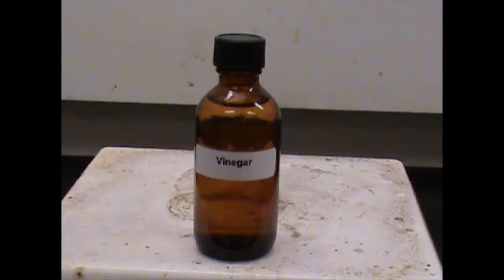For part A, the base we'll be using is 0.3 molar sodium hydroxide. Using your knowledge of concentration, you should realize that this is quite dilute. The acid we're using is acetic acid solution, which is commonly called vinegar. The problem is you don't know the concentration. Your task is to determine the concentration of the acetic acid.